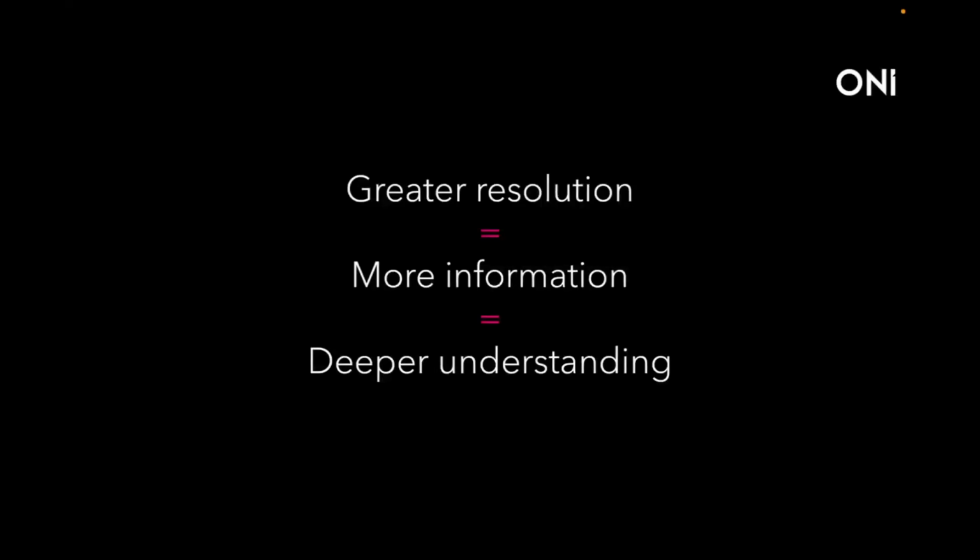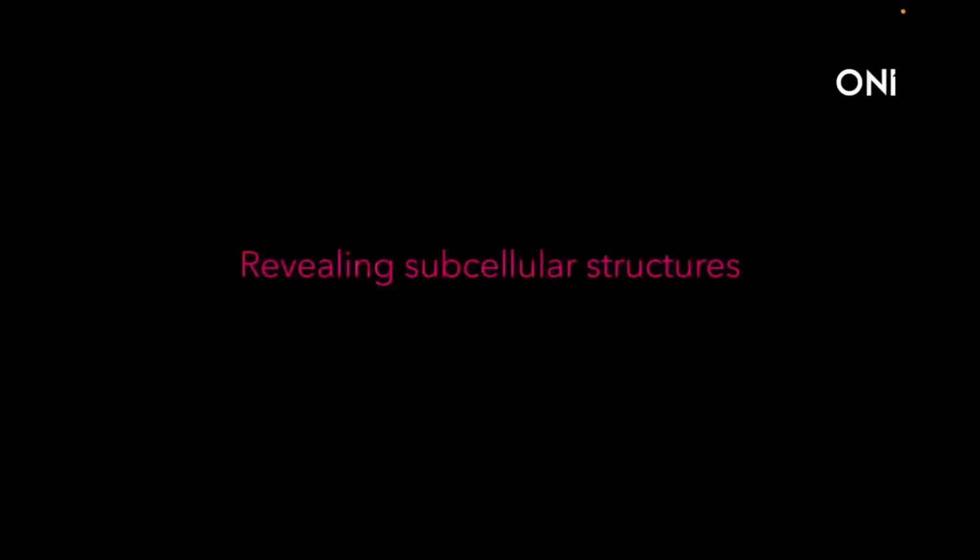So firstly, one of the things that super resolution can do in immunology is to reveal subcellular structures. As you can imagine, most subcellular structures have some level of organization at the nanoscale, and they may be dynamic or they may be highly organized at the nanoscale. And so understanding them through super resolution can be very informative.